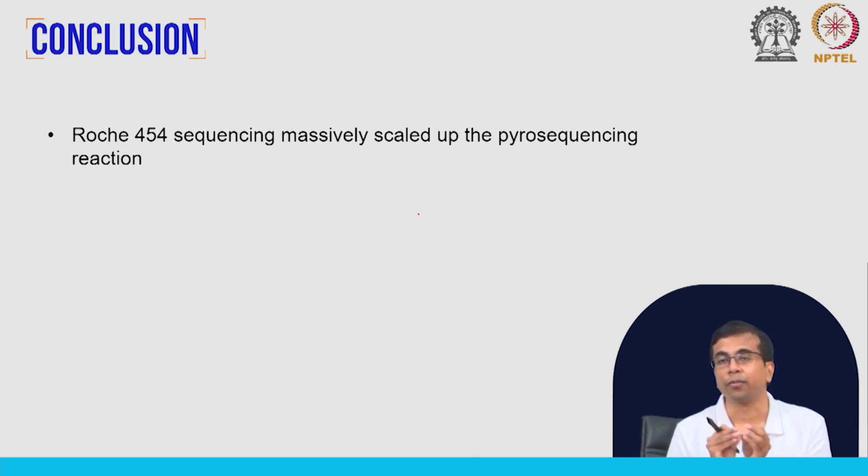It is sequencing by synthesis, which means you are synthesizing the complementary strand of the DNA molecule present on the bead, using DNA polymerase, dNTPs, etc. Once there is an addition of a base, whether A, T, G or C, there is a release of pyrophosphate, which through a series of reactions is converted to a light signal.